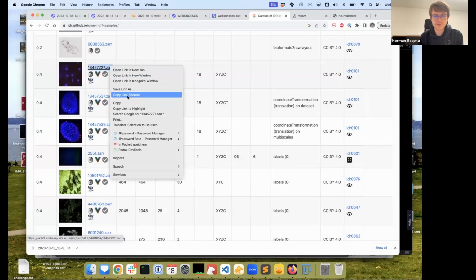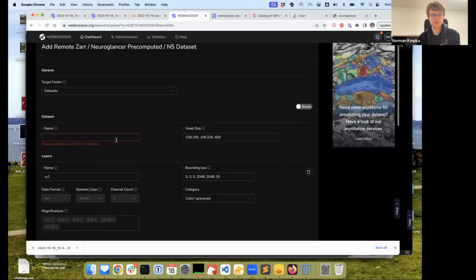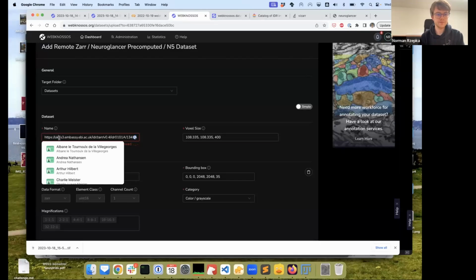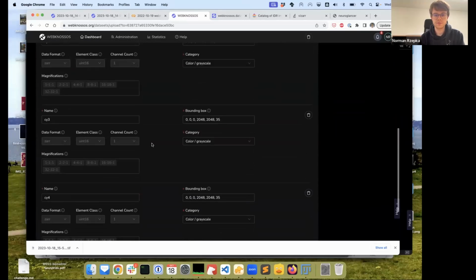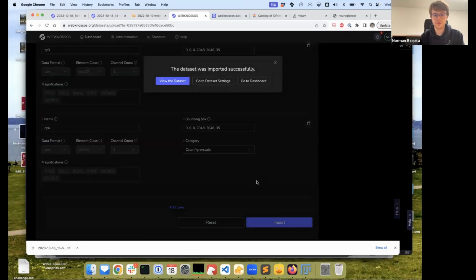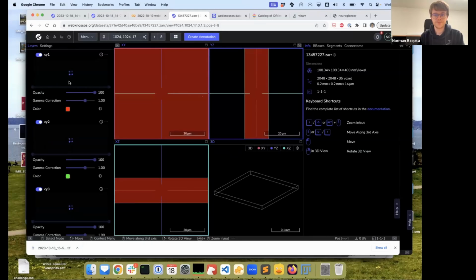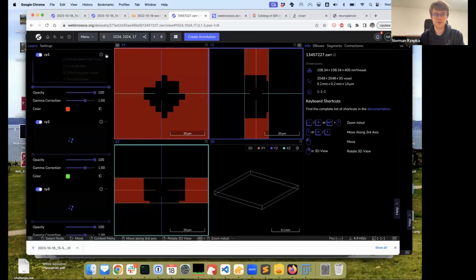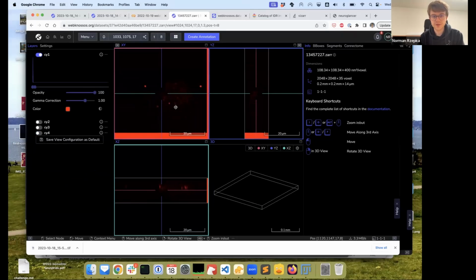Okay, I'm just randomly trying out some data sets from this list here. All right, so it seems to be picked up. Let's give it a name and let's import it. Fast loads. Let's just stick to one channel for now, just so that things load a bit faster.